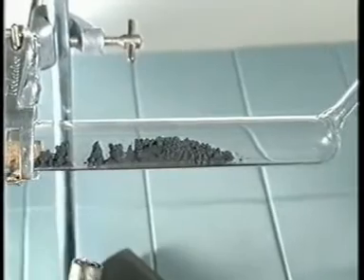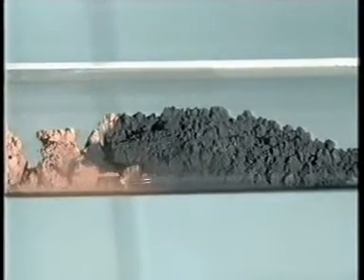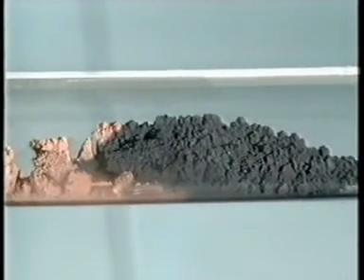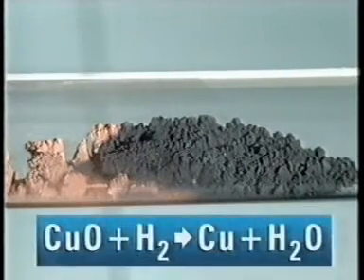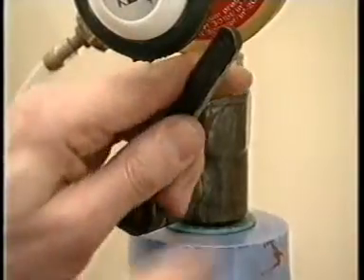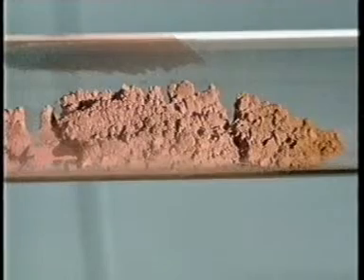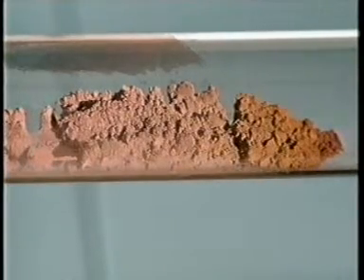Heat the copper oxide in this atmosphere of hydrogen and it quickly changes colour. Hydrogen reacts with oxygen in the copper oxide to form water. Copper metal is left behind. While the copper oxide is reduced, the hydrogen is oxidized. But as soon as the hydrogen and heat are removed, the reaction reverses. What's happening to the copper?